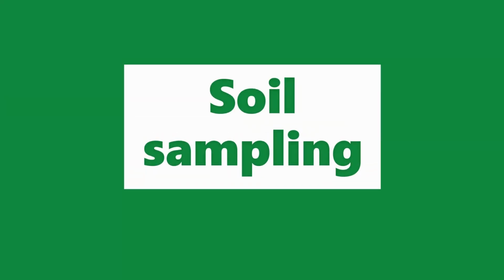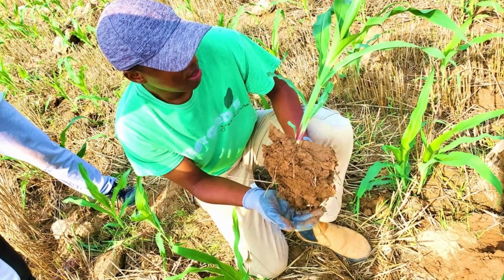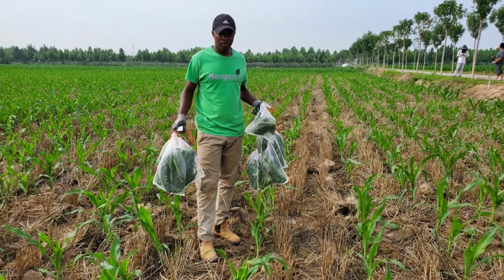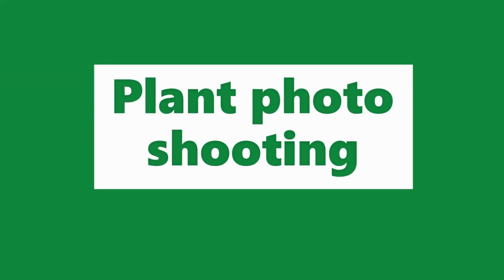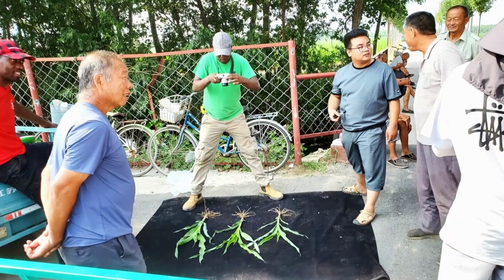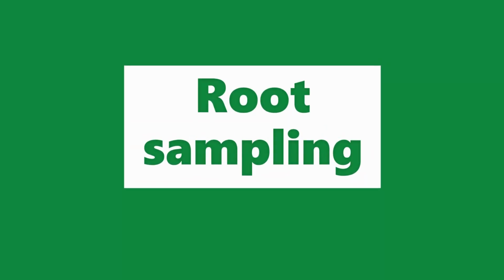Also in soil sampling, you can see this auger soil sampling. This is one of the field experiments where we usually collect data that will be analyzed to get the soil concentration of different nutrients, like this one, keeping the soil, and then it will be analyzed. And there is another technique, photo shooting. We shoot this and then even in the paper you can publish this so a viewer can understand the difference between the treatments using the photo. We use this technique in root sampling where you can see different roots.